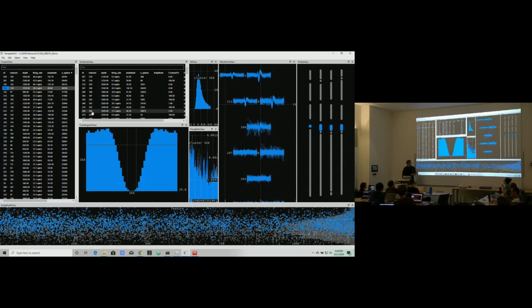Is there anything you could do to take those out during manual curation? Good question. It depends what you mean by manual curation. Some of these over-merges we might be able to fix by doing some manual curation, which will mean cutting out a little bit of these clusters. Others just won't be possible to fix if they're at the noise floor. There's just no way to set a better threshold there. So you want to recognize which of those 2 situations you're in and act accordingly. If something's at the noise floor and looks contaminated, nothing you can do about it, discard it and move along to the next one.